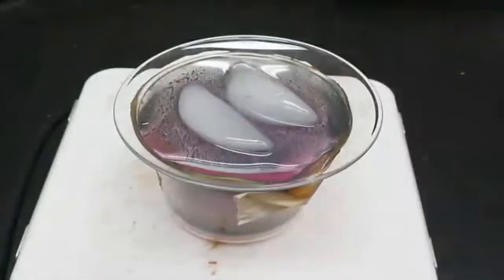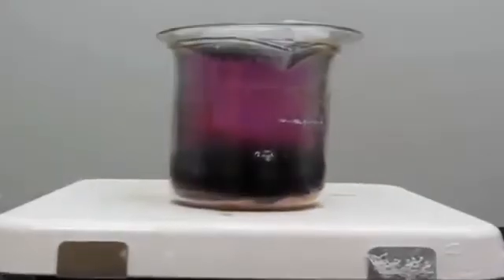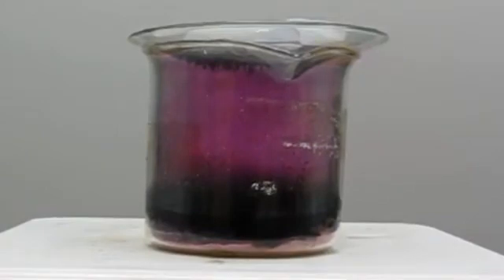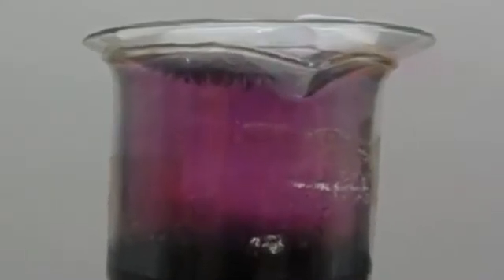Here's what it looks like from the top. You can see the ice, the watch glass, and then you can start to see that the crystals of iodine are forming underneath. After a while, the crystals will have formed on the bottom of that glass, and you can see them here sort of dangling down from the watch glass.